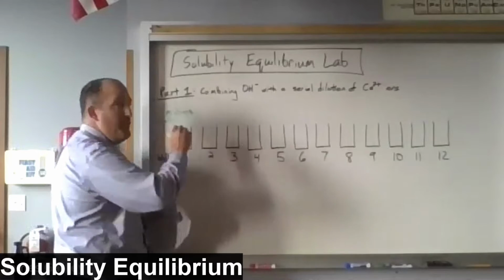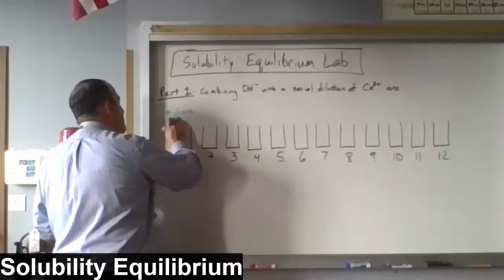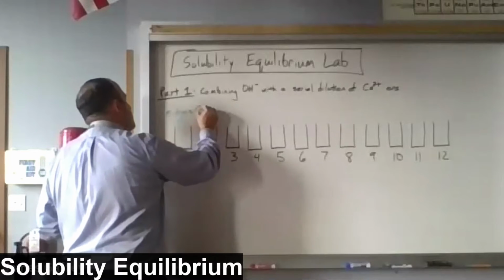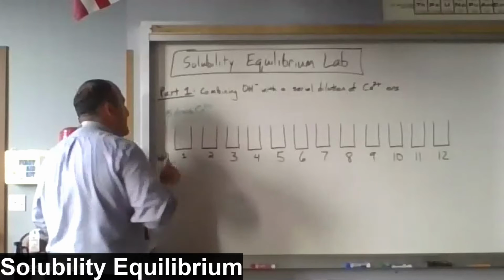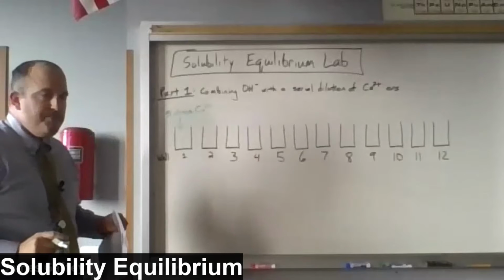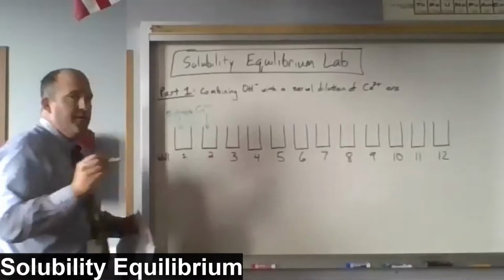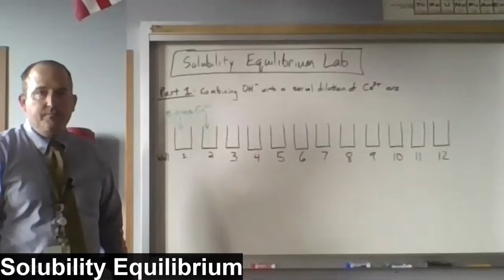I'm sorry, calcium nitrate. And I'm only going to abbreviate that with calcium. How about that? And we're going to add that to well 1. I'm also going to add 5 drops of calcium ion solution into well 2.